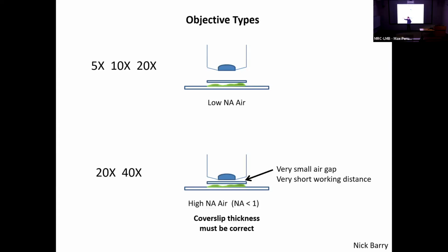The results of these lenses is dependent on how you do it, but the 20x, 0.75 will get you down to 350 nanometer resolution easily. This is a very good choice for looking at large areas of tissue. But you have to make sure you get all of those details right in the sample prep for the 0.95 lens to perform at its best.